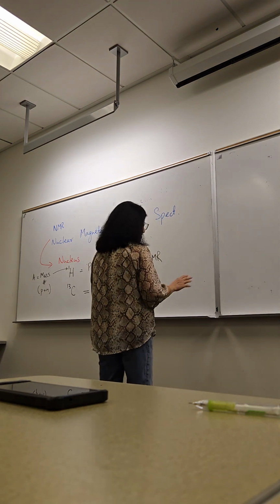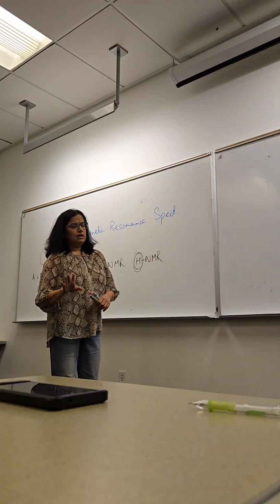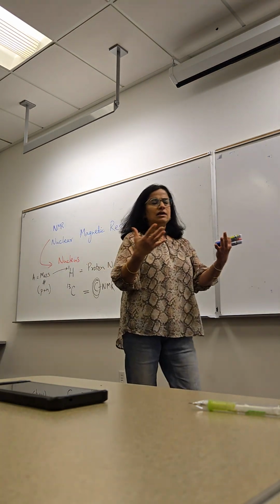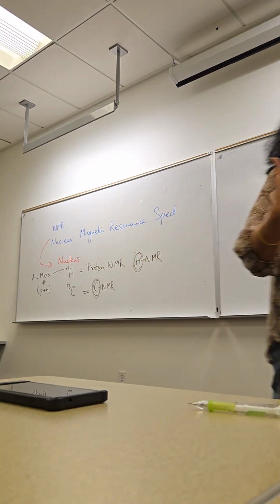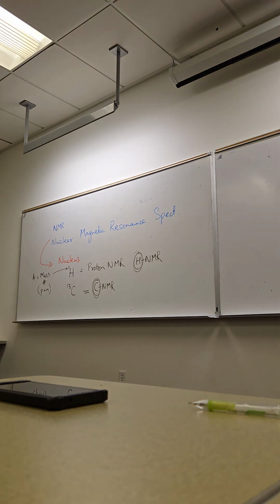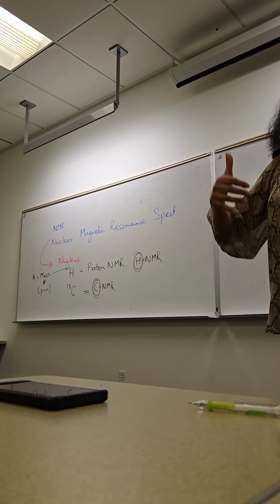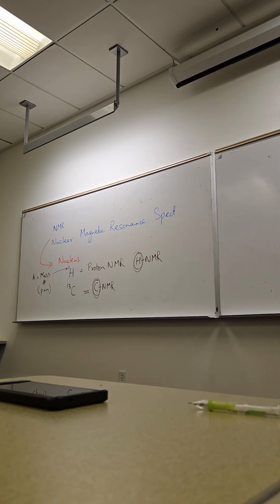Once again, we're not discussing the physics of it. What does resonance mean? How is it done? How is the instrument set up and all of that? We are not getting into that. The idea here is that we place a sample in a magnetic field. The instrument upstairs has a magnet, and the sample goes inside that magnetic field.